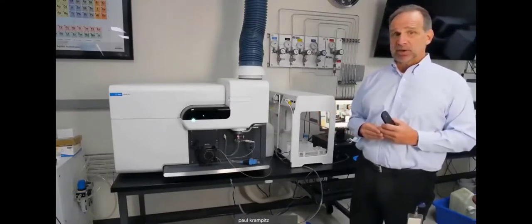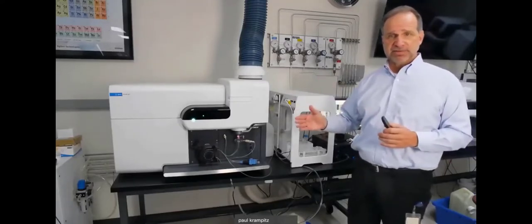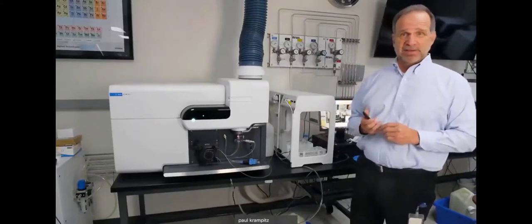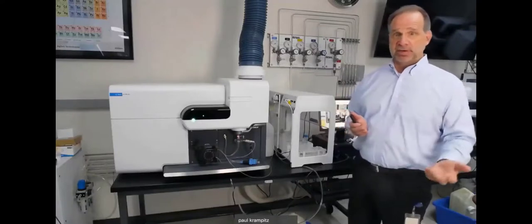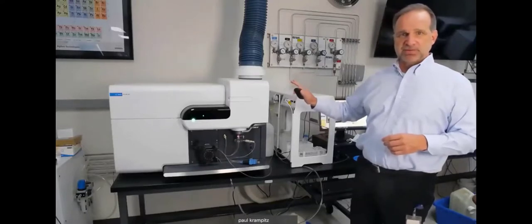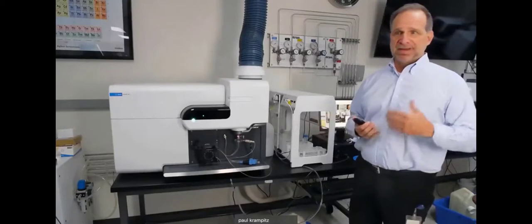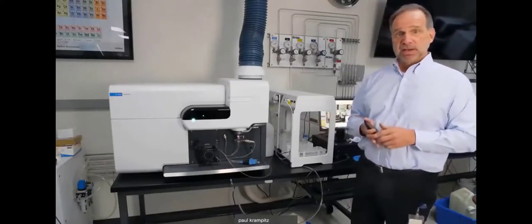Its linear dynamic range, going from low concentrations to high concentrations, is much greater than in AA. I think for those of you that are familiar with AA, you're used to diluting 100 or 1,000 or 10,000 times. Here it's a little bit more similar to an ICP as far as linear range. We can get up into the hundreds of ppm and then down into the ppb range for detection limits.